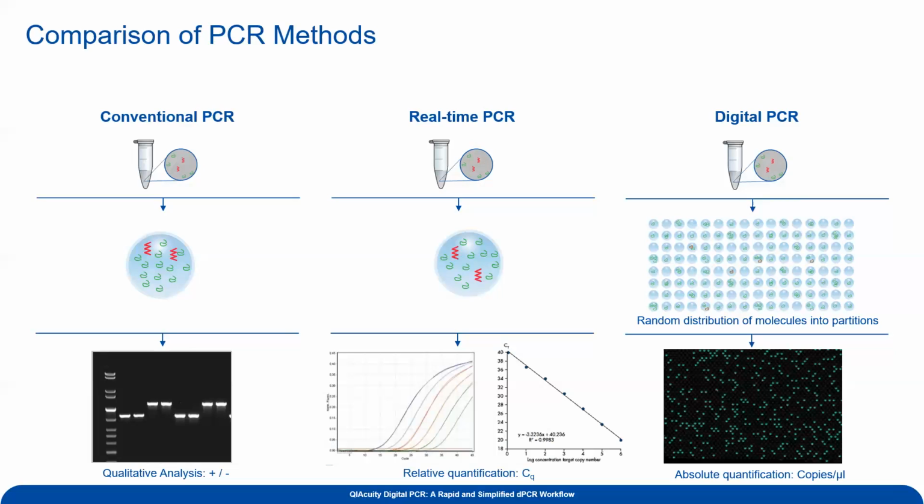And doing the right control measurements. So where qPCR tends to fail a little bit though, is when you want to ascribe an absolute number to what was in your sample well. So there is a method for doing that in qPCR called absolute quantification. And what you're seeing here is basically a subset of those data.